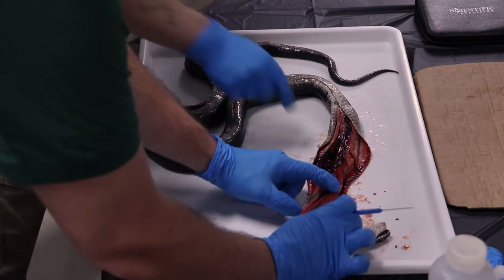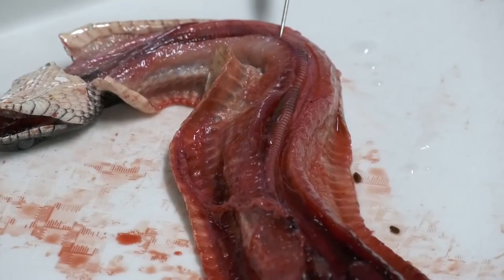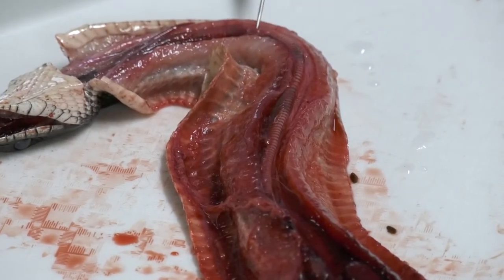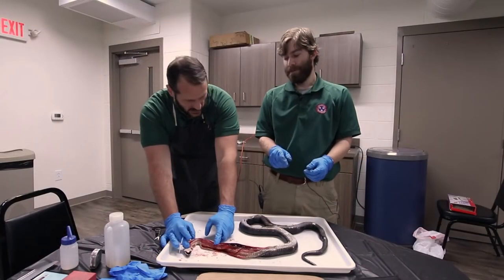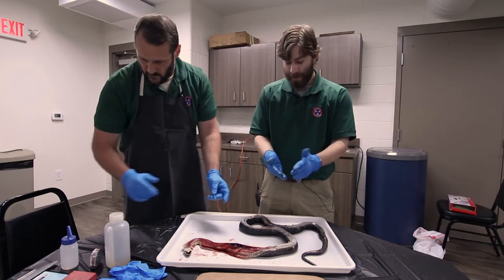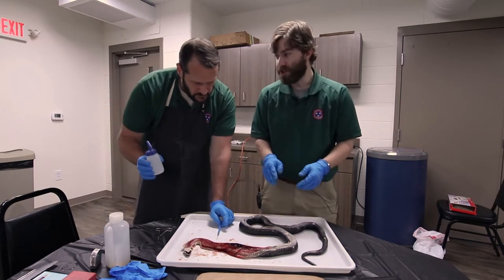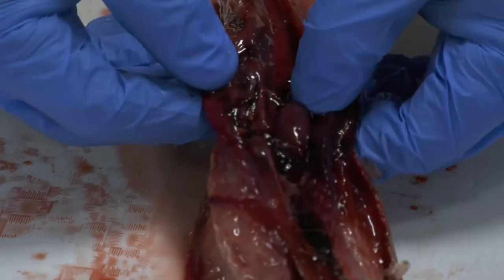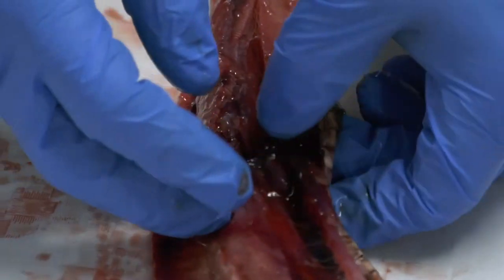So as we pointed out, this extra long trachea here that you can see from these cartilaginous rings, just like we have on our trachea, I guess you could consider that all of this is neck. Would that be safe to say? Mm-hmm. Sometimes people refer to anything behind the head up to the cloaca as just the trunk for a snake. All right, actually, let's pull that out. Is that what I think it is? Heart. That's what I was wondering. Yep.